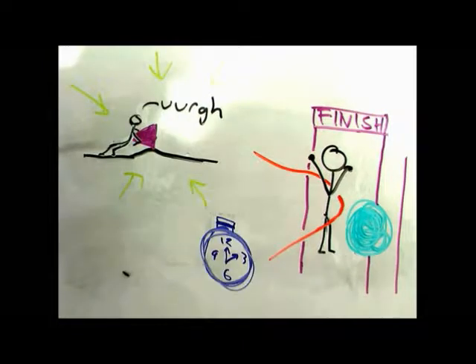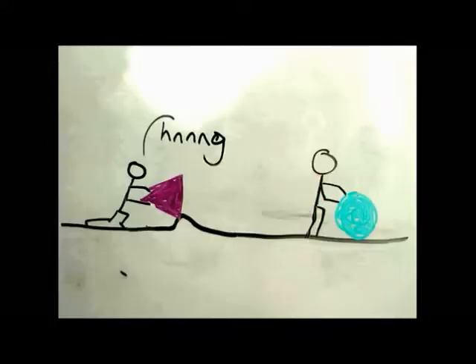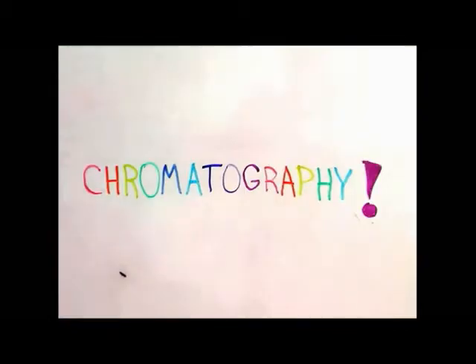By measuring how fast a substance reaches the end, or how far the substance reaches, you will be able to identify what this mixture consists of. And that is chromatography.